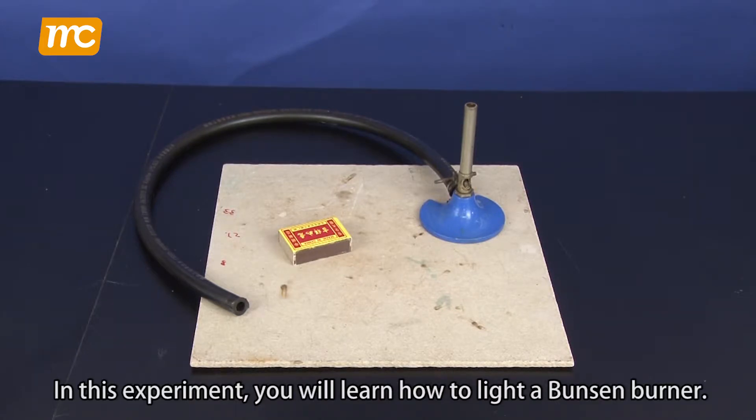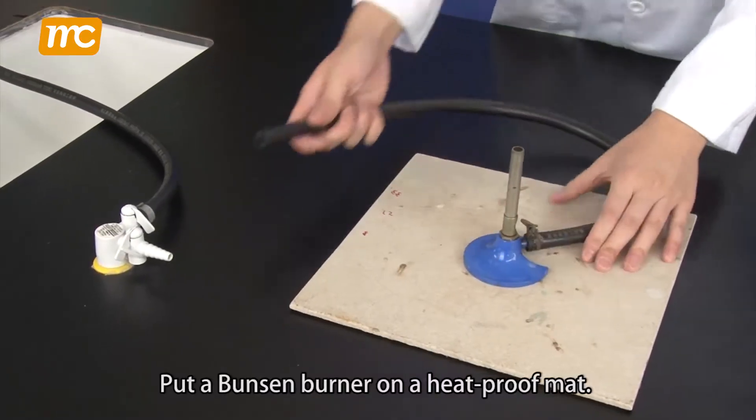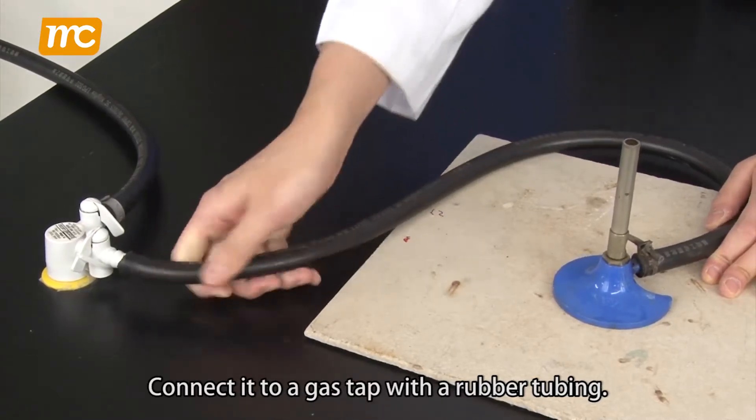In this experiment, you will learn how to light a Bunsen burner. Put a Bunsen burner on a heatproof mat and connect it to a gas tap with a rubber tubing.